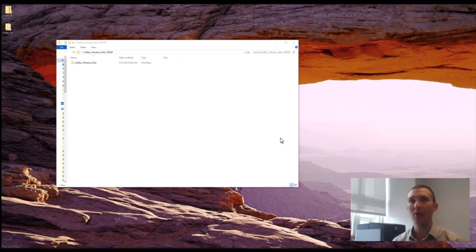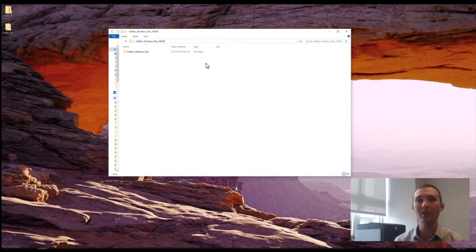So over here, I've downloaded UniDec from the web. You can find us on GitHub. You can search for UniDec or look for my website. When you download it, you're going to get a zip file. Now, you don't need to install anything. You just unzip this file. You're going to get a folder that's going to look like this.